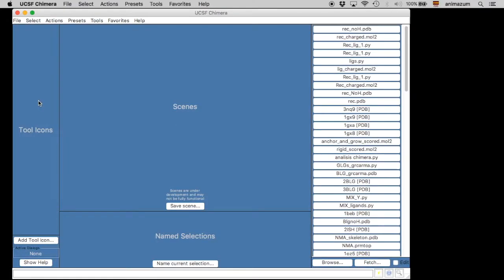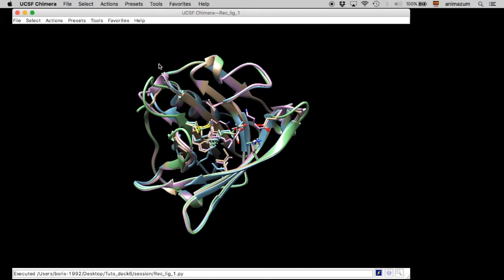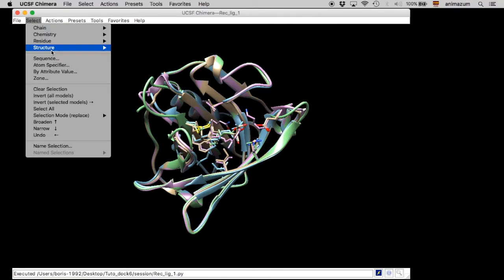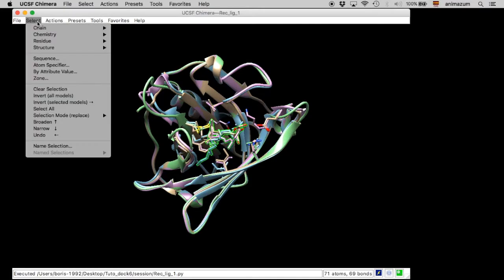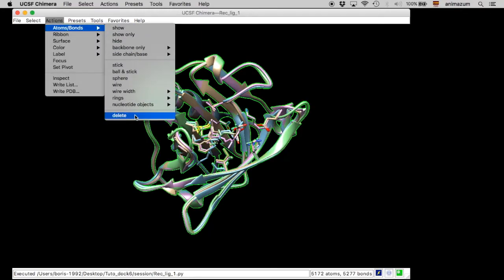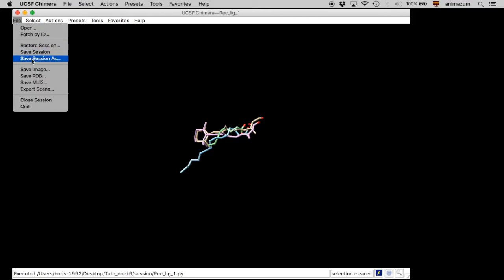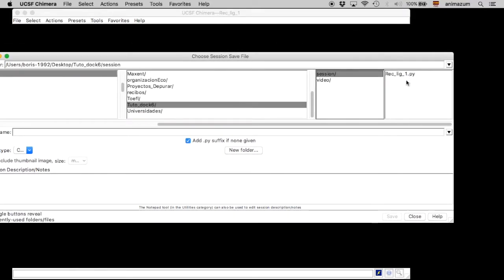We are going to close the session and reopen the session that we saved before. But in this case, we are going to select only the ligands and delete the receptors, because we want to prepare the ligands. Here they are. Now we are going to save again another session, just in case something wrong happens.